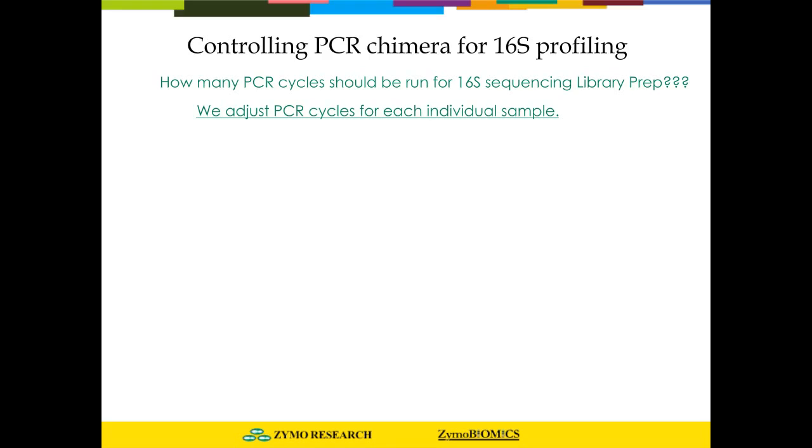For convenience, and in order to have enough PCR product from a variety of samples, many researchers choose to have a fixed and relatively high number of PCR cycles for all different samples, especially in the format of 96-well plate. For example, in the Human Microbiome Project protocol, it says like 30 cycles. And in the Earth Microbiome Project, they recommend the use of like 35 cycles.